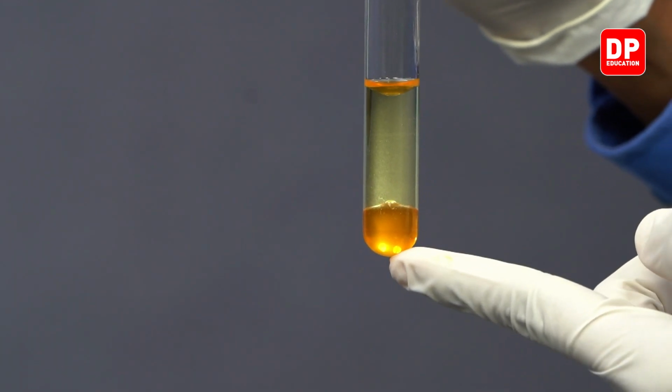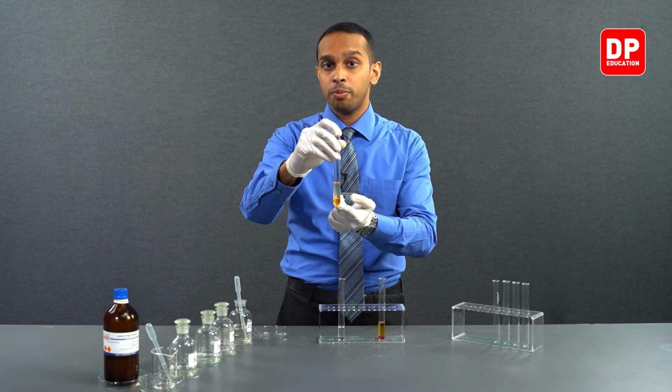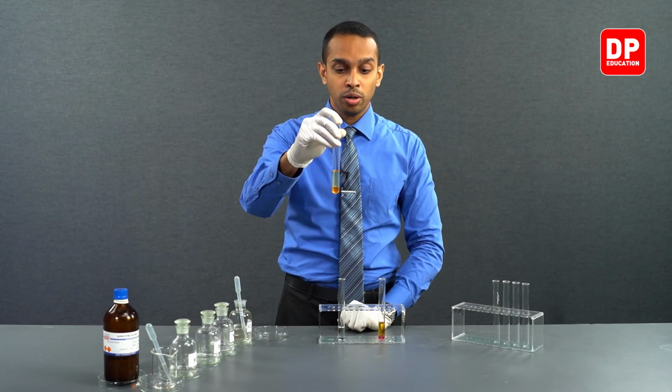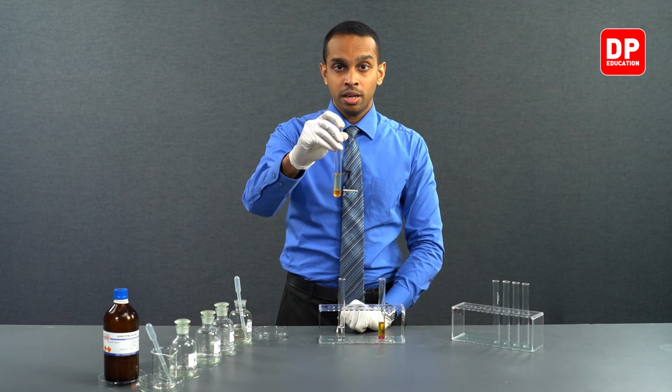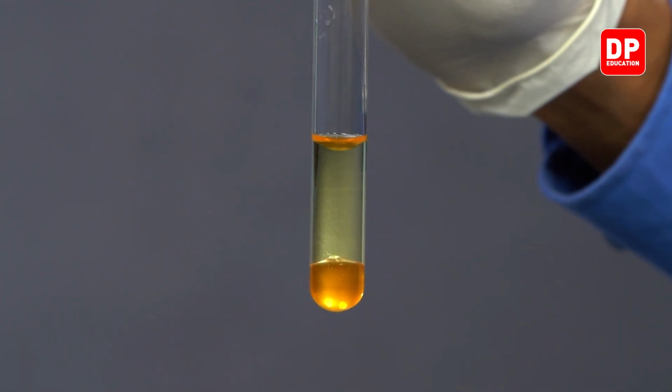And instead of carbon tetrachloride, you can use chloroform as well. If the nonpolar organic layer turns an orange color, that is an indication of bromide ions being present in the aqueous layer.